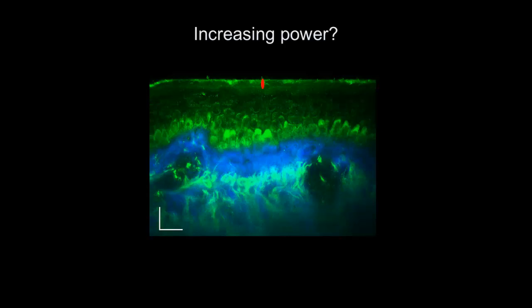So up here, as we know, the focus is still relatively confined, not so much affected by scattering because it just went into the tissue. It's compressed, the resolution is high, the signal to noise is high, because you don't get a lot of signal from the other contributions outside of focus. So high resolution, high signal to noise. If we go deeper, hopefully you can see that, now move it in here, what happens?